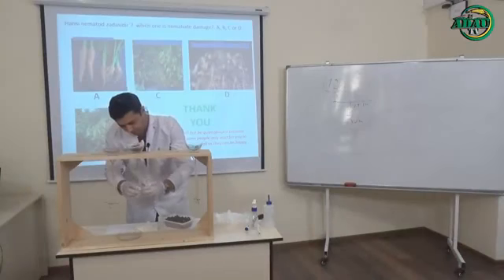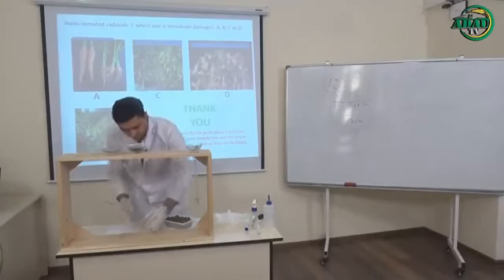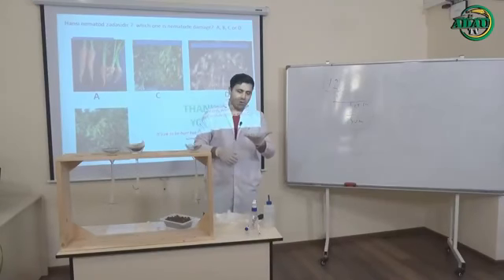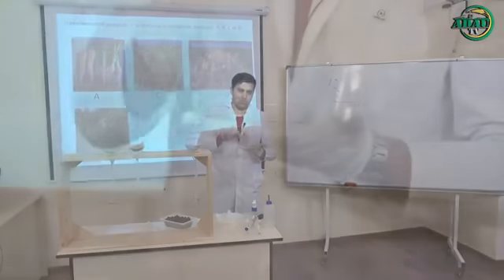It will be so useful. After that, you can take the glass, put it under the microscope, and then begin to search for nematodes.